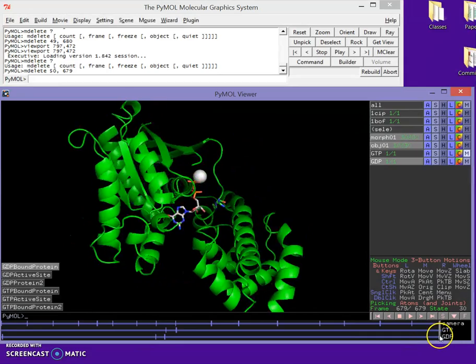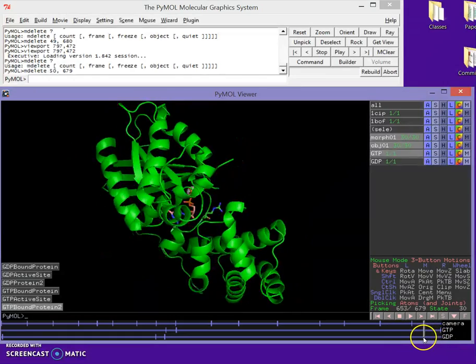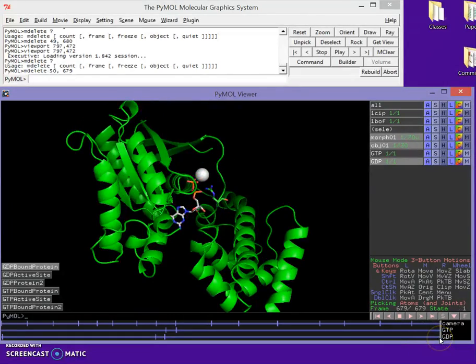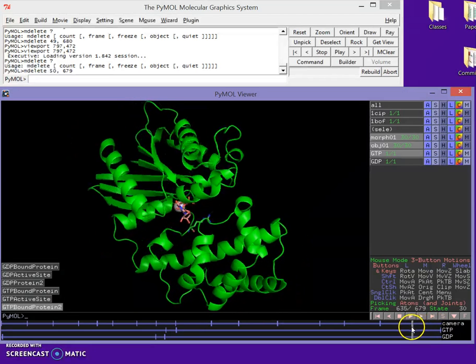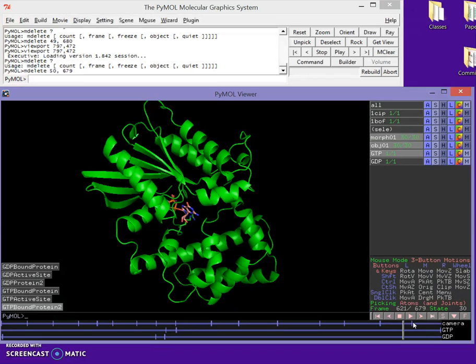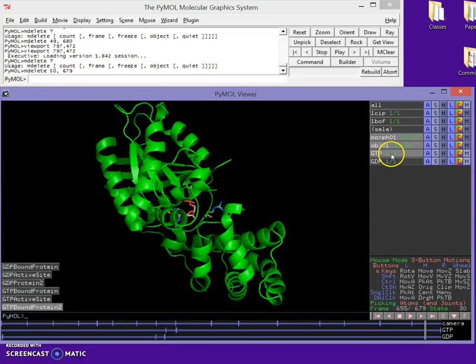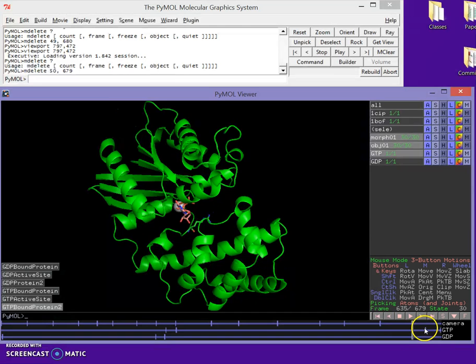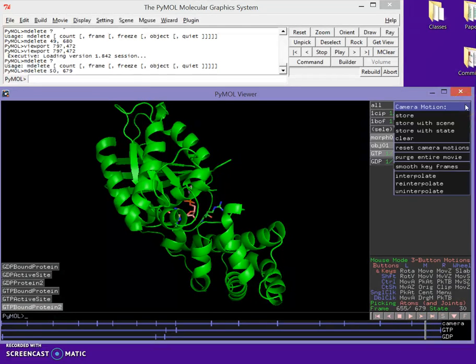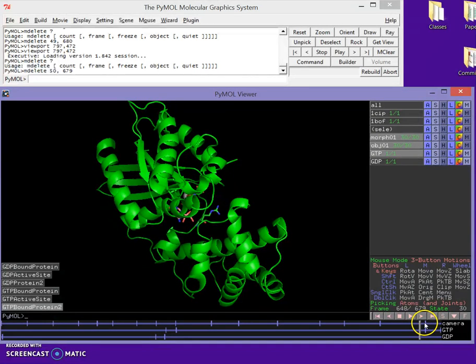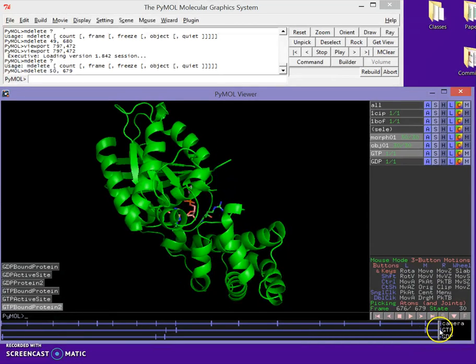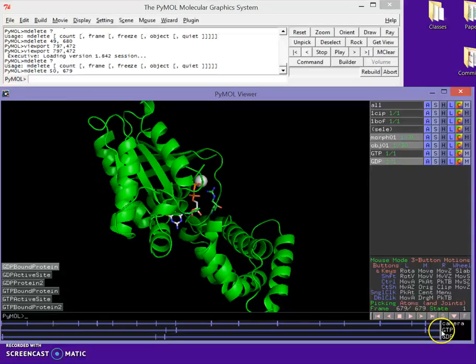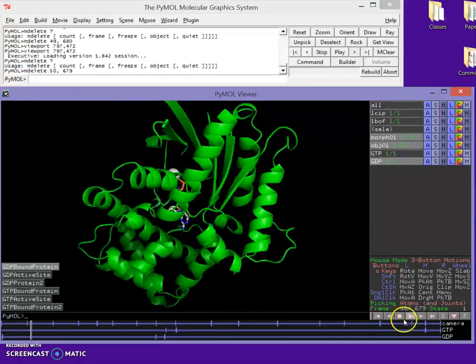Did we lose anything there? Nope. It looks pretty good. So it looks like that's kind of funny. We want to make sure that our frame here looks like it's switching the GDP there. So I'm just going to copy this last frame. I'm going to make it where it switches here. I'm going to make GDP stay. I'm going to store that. Okay, and then I'm going to just copy that. We'll store all here. There we go. And then I'll just copy that out to the end. You're going to save me? Looks like it. Sounds good.